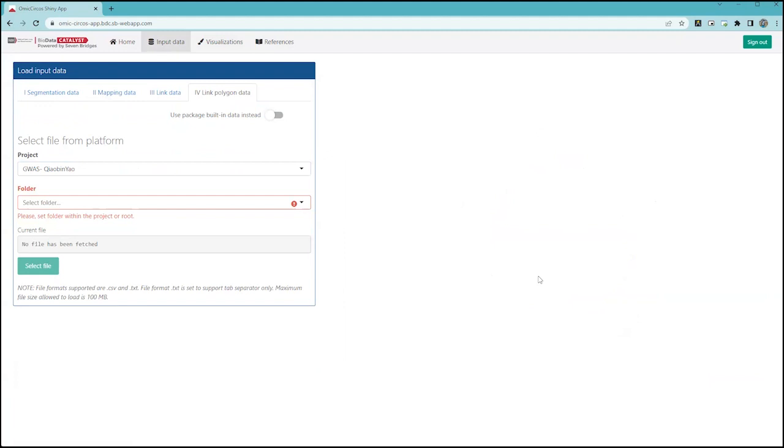So great question, Prithvi. So I think we should follow up. Can we actually get this working with GWAS data? I think that would be fantastic. So any questions about that? About what does it mean by link busy? I don't know. That's a good question. It's following the vignette. So I tried to follow it when I was preparing, but it's still a bit confusing for me. But I really do like the interactivity of this.